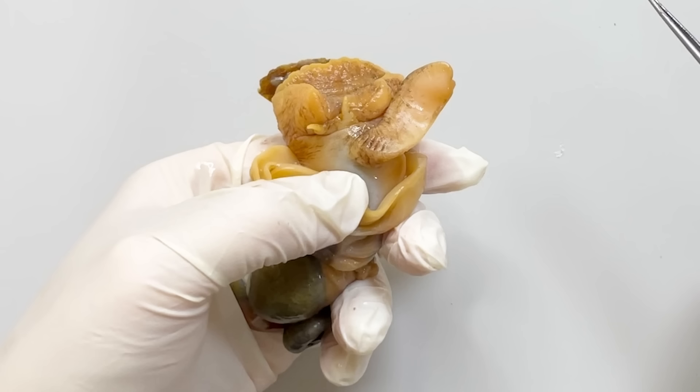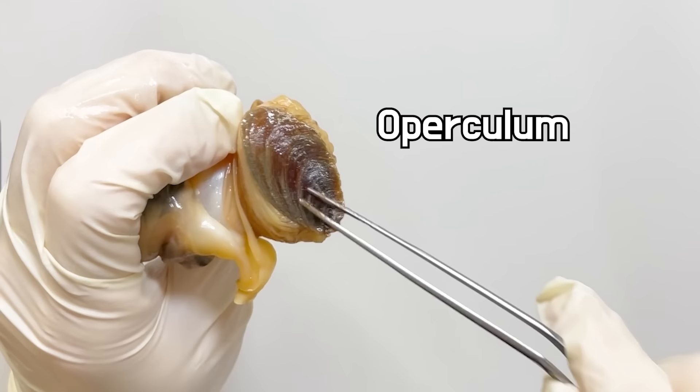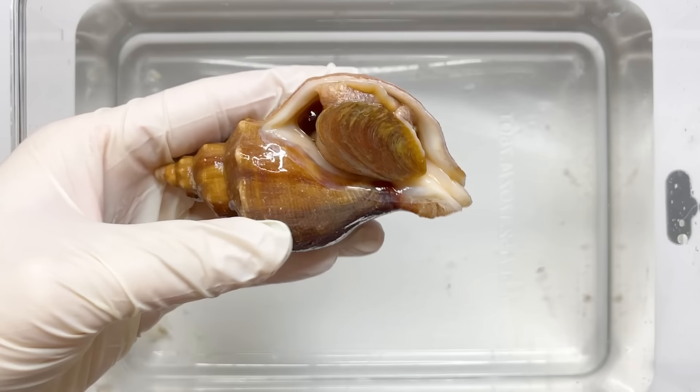Females do not have a reproductive organ — they only have an opening for laying eggs. The lower part here is the whelk's foot, and at the back of the foot you can see the operculum attached. During dangerous moments, the whelk can close the operculum to protect its body.